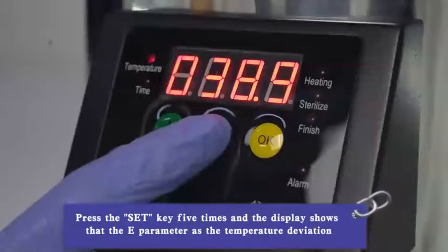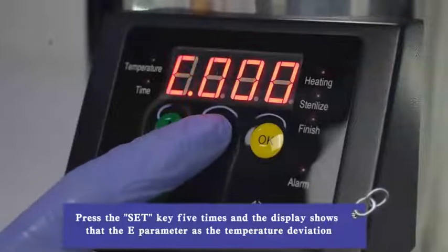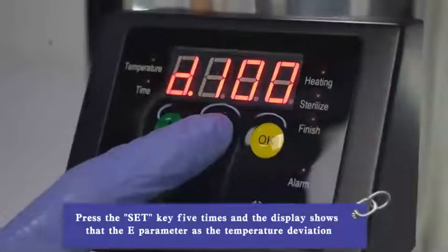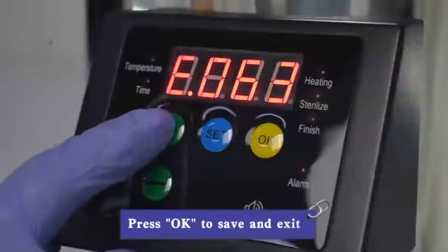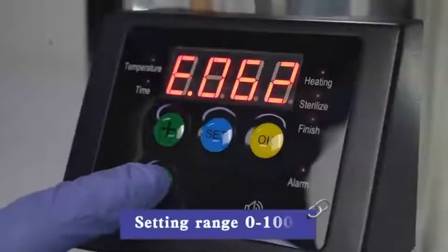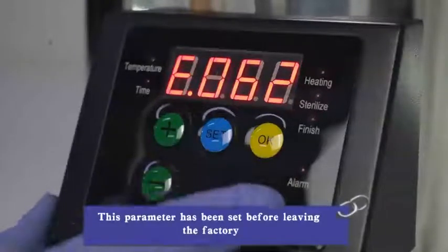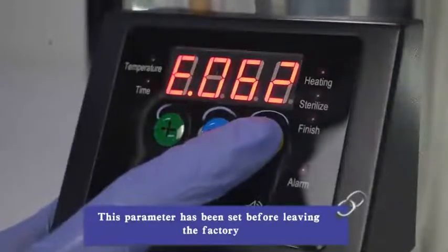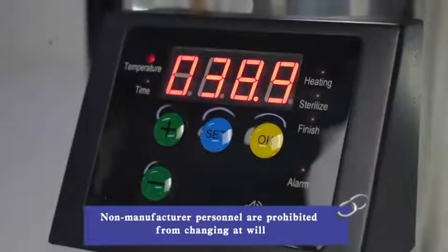Press the SET button five times and the display shows parameter E: temperature deviation. Press plus or minus to modify the value. Press OK to save and exit. Set in range 0 to 100. This parameter has been set before leaving the factory; non-manufacturer personnel are prohibited from changing it at will.